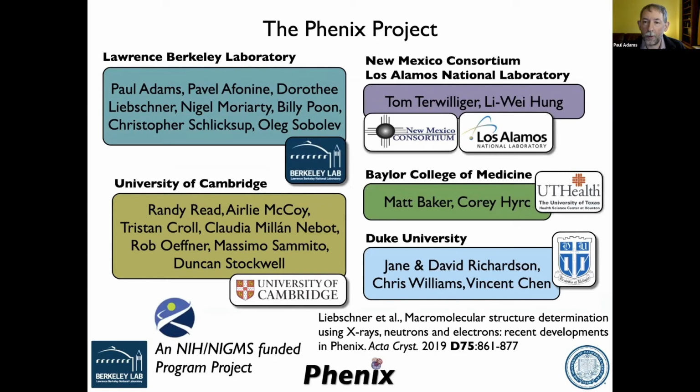But yeah, right now, even if you could supply the parameters, there are these formulations which you're aware of. I'm completely sure of the formulations that do rely on the wavelength. If you could supply those to Phenix, we couldn't use them in the way that you would want right now.